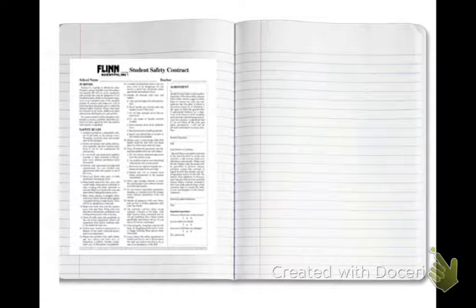Now, on the left-hand outside corner of this, I'm going to put page number 2. This is on the back of page number 1. On the next page, outside corner, I'm going to write page number 3. That way, every single page has a number, and it's on the outside corner. So if you're flipping through the bottom part of your lab notebook, you can see exactly what all the pages are.